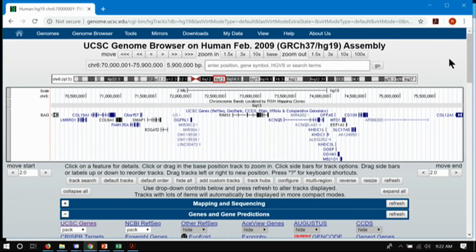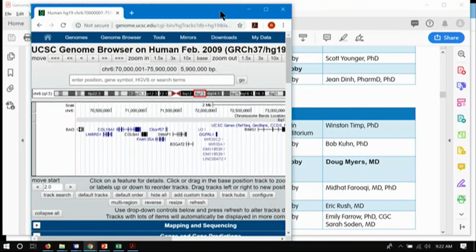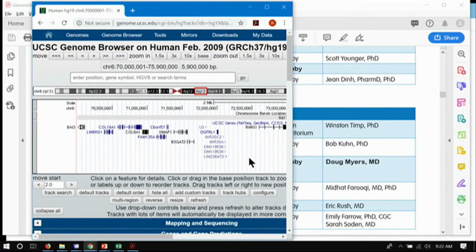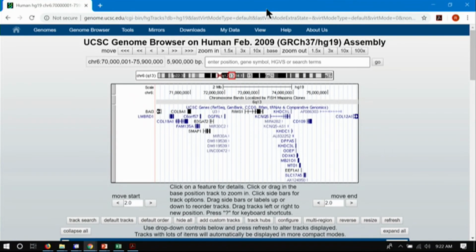Another thing you might want to do is see these two genes that are on the right and left, but they're really far apart, and you might want to scrunch the screen down a little bit. If I make my browser window a little narrower, my Firefox window or my Chrome window, and hit resize, then the browser graphic will redraw with the new window size. And so that graphic now matches the size of the window there. And so you can scale it that way by squeezing it together, and it gets a little taller that way because all the same data are still being shown.